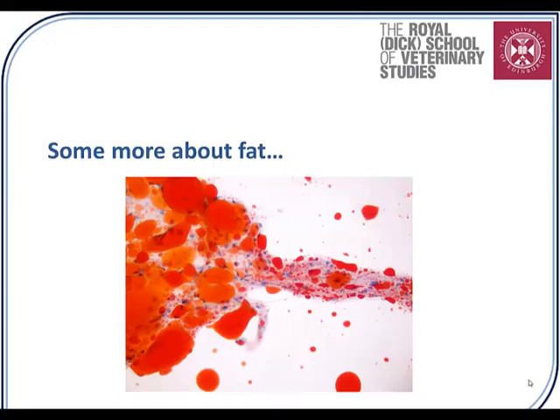The vast majority of you who responded to this picked up on the point that in actual fact, the cell membrane itself will still stain very, very delicately. And of course, the nucleus, if it happens to be present on the plane of section that the tissue has been cut through, will also be visible. But it's the cytoplasm that doesn't stain because the fat has been removed in the processing.